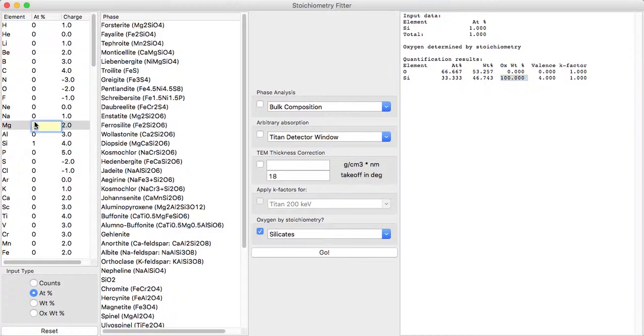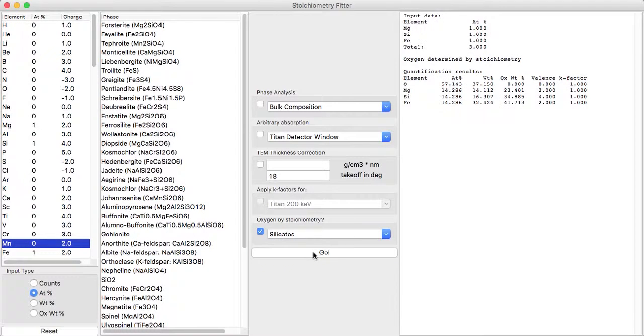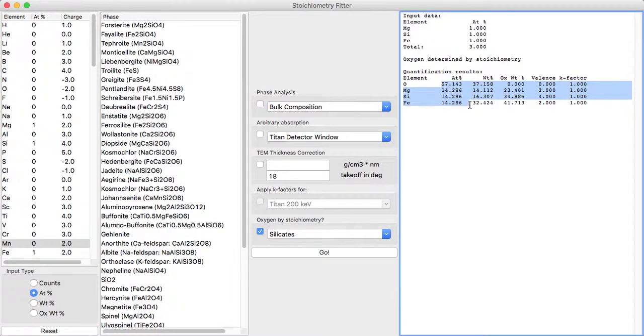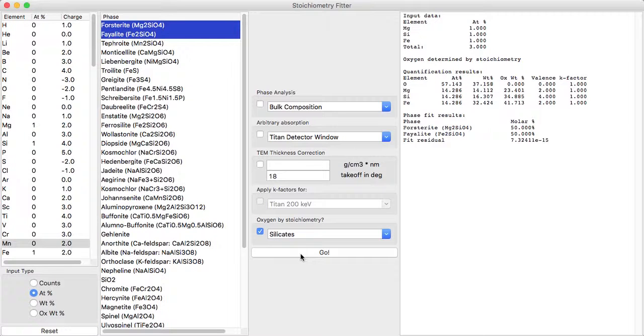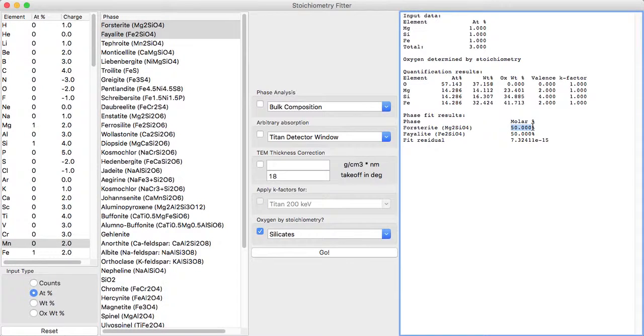Now, really, you would want to do something more complicated. These could be actual atomic percents or weight percents, depending on where your source of the data is from. Here, this is olivine now. And you could even compare it against a solid solution. So say it's forsterite-fayalite, that tells me it's Fo50. And that's a really good fit.